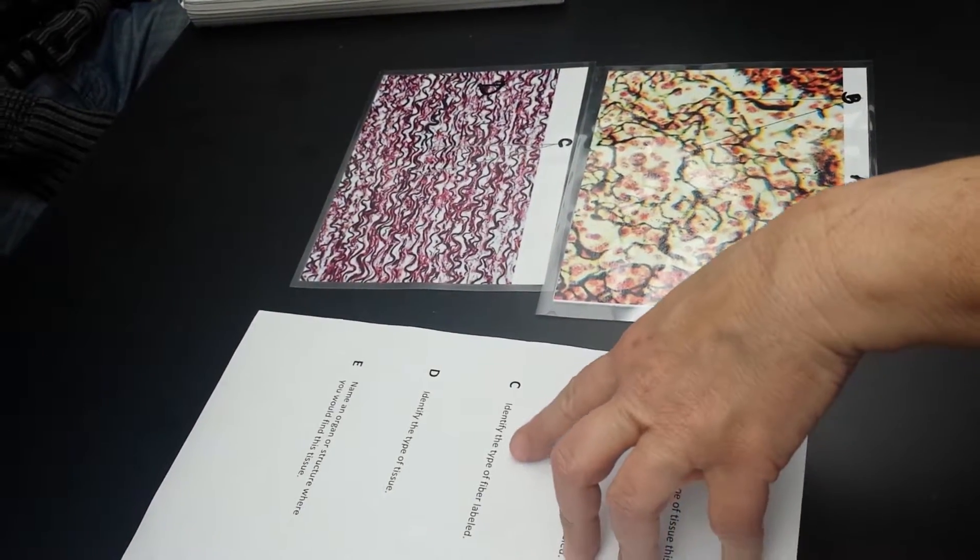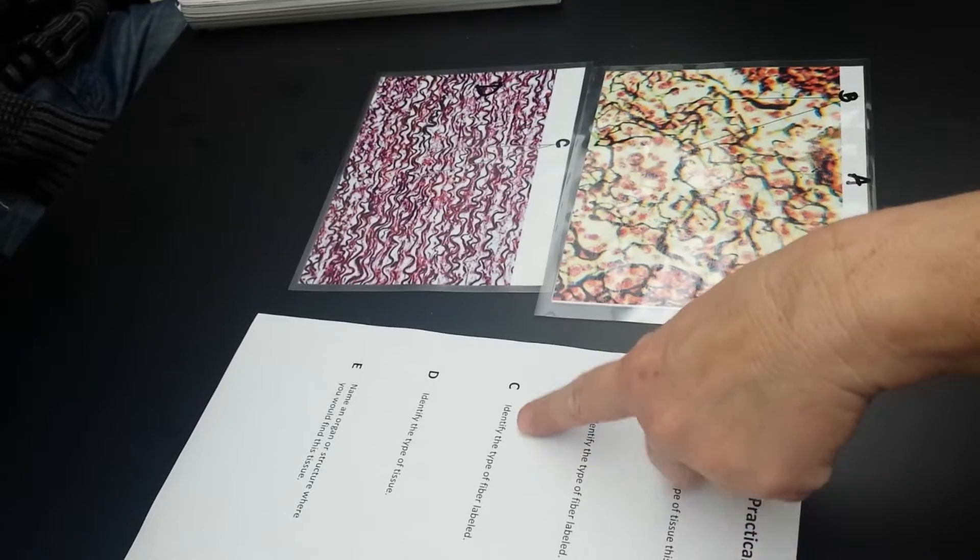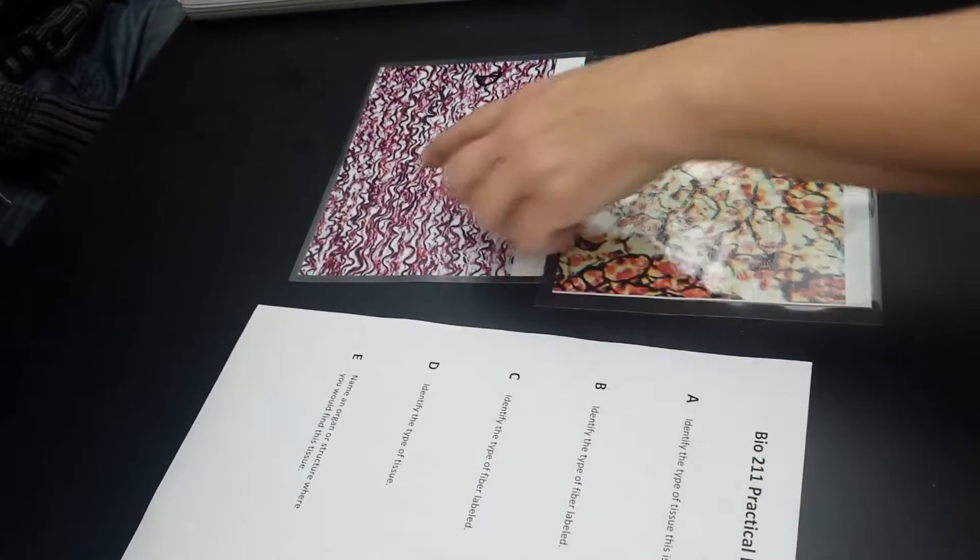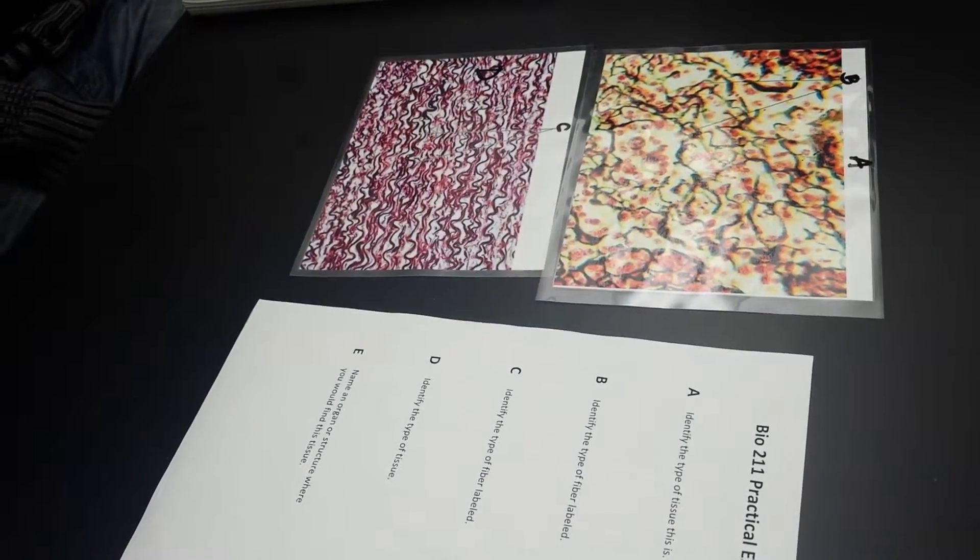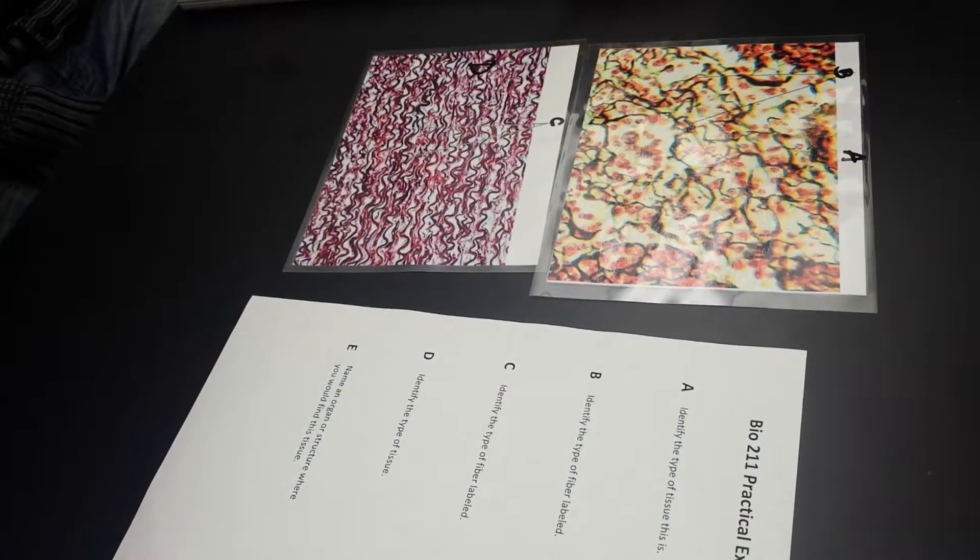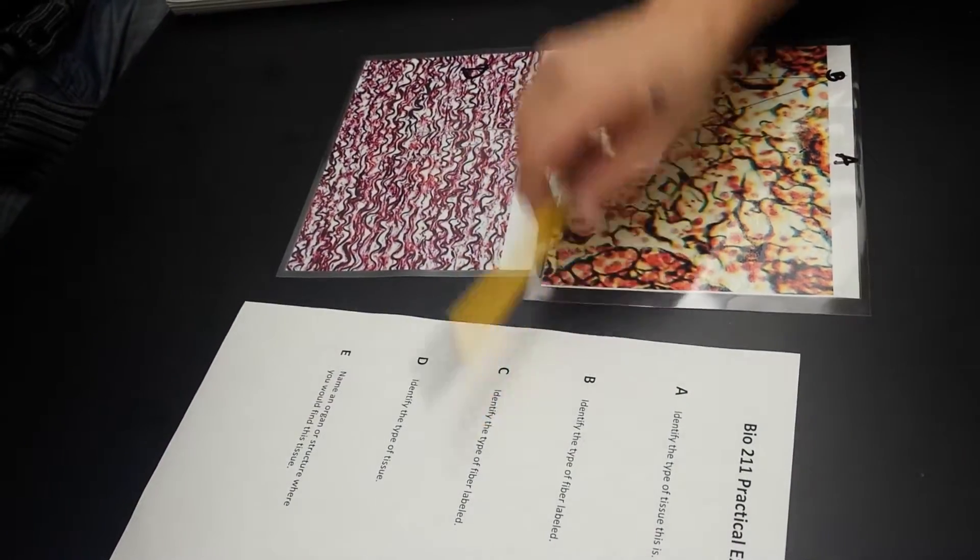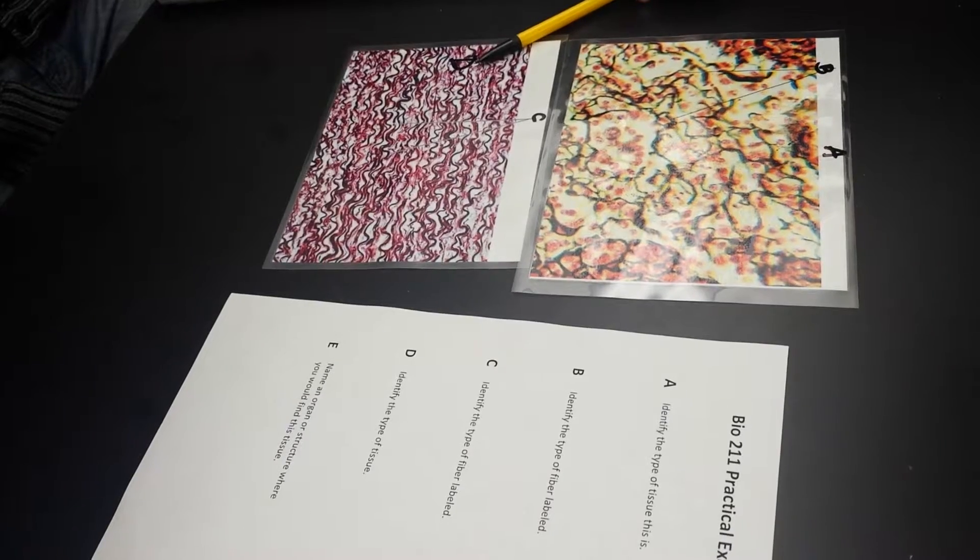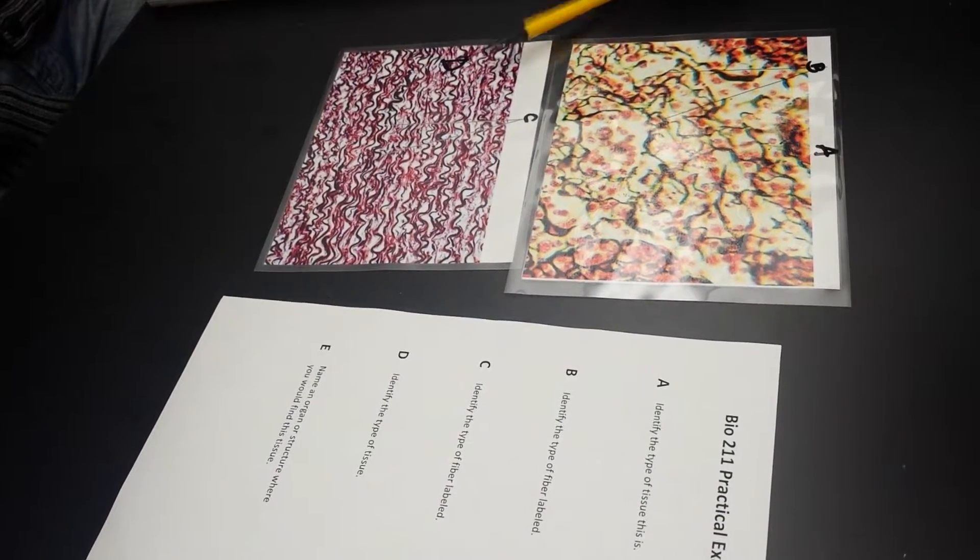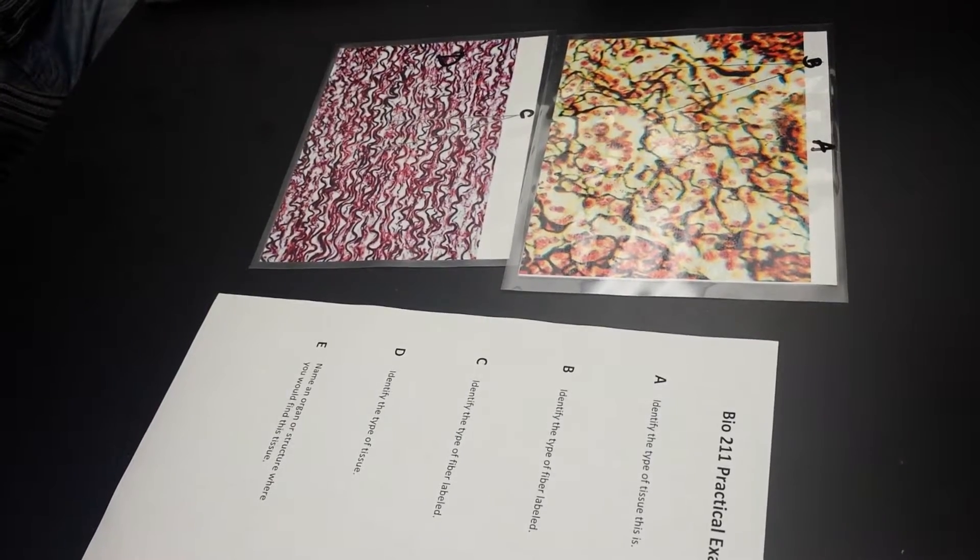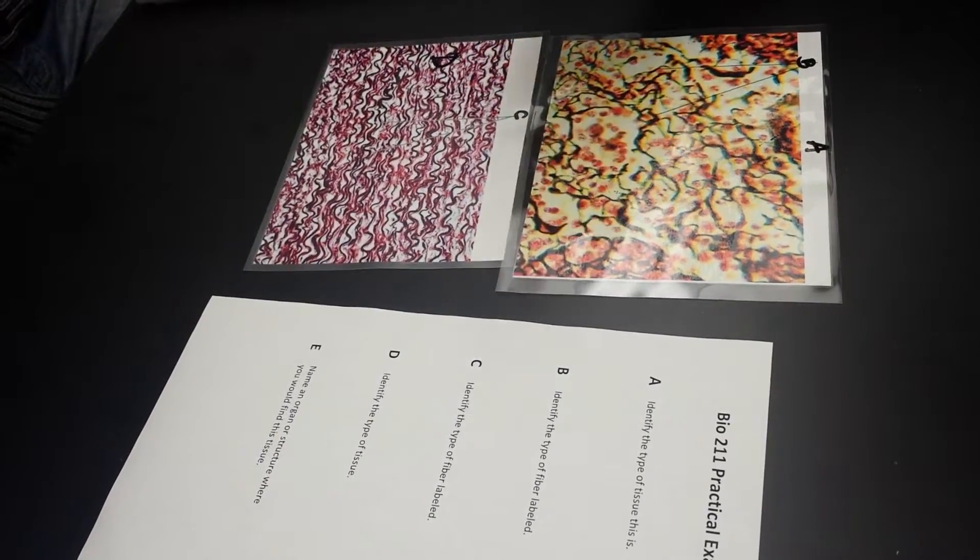C, identify the type of fiber labeled, elastic fibers. D says identify the type of tissue, so this is what? Elastic. Elastic connective tissue. Don't start saying cartilage after every elastic, elastic connective tissue.